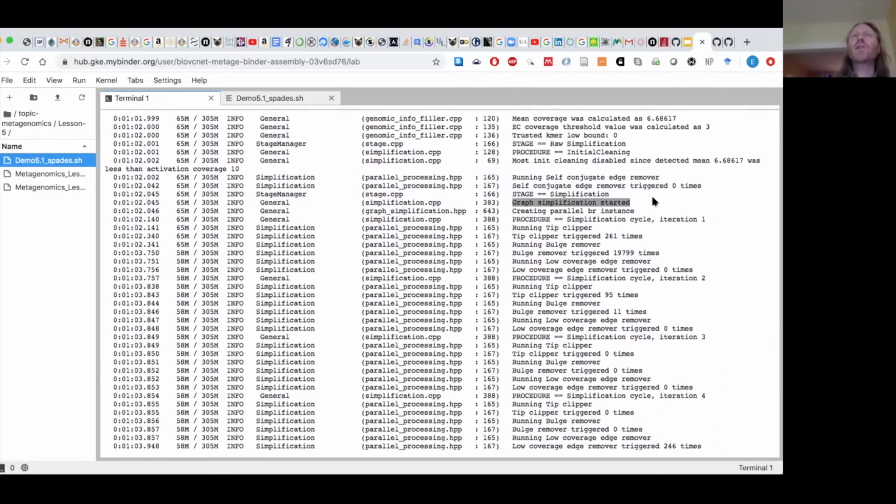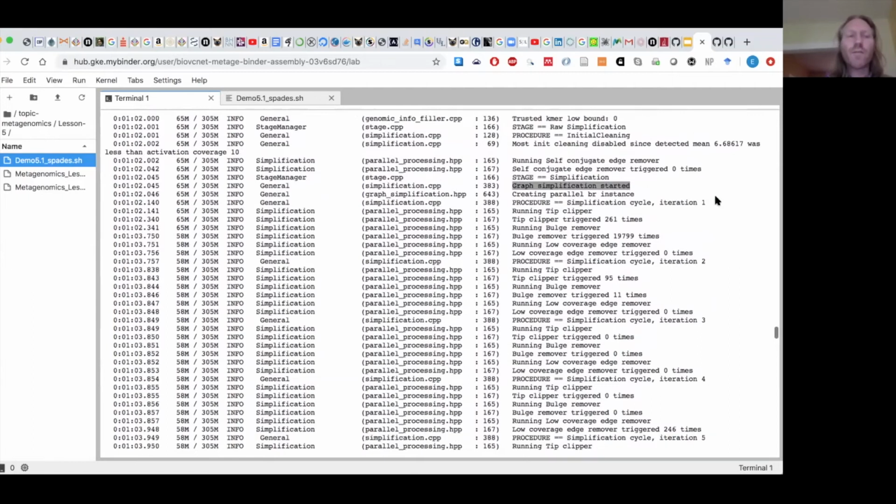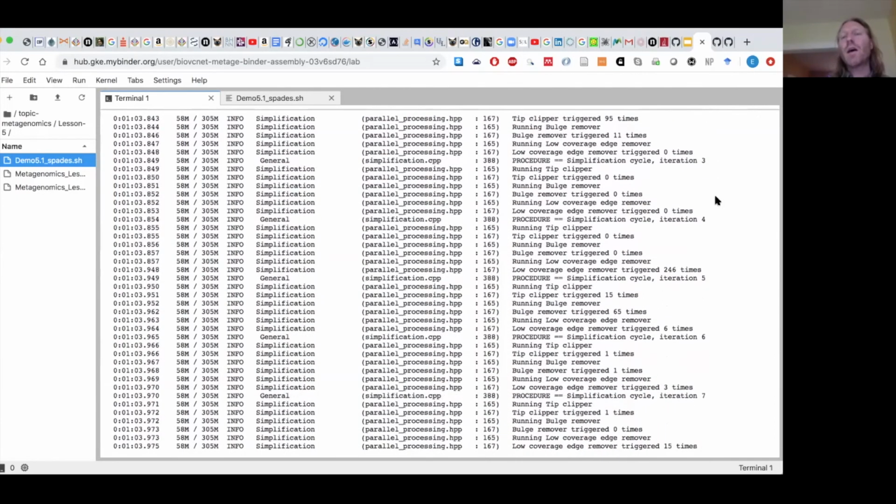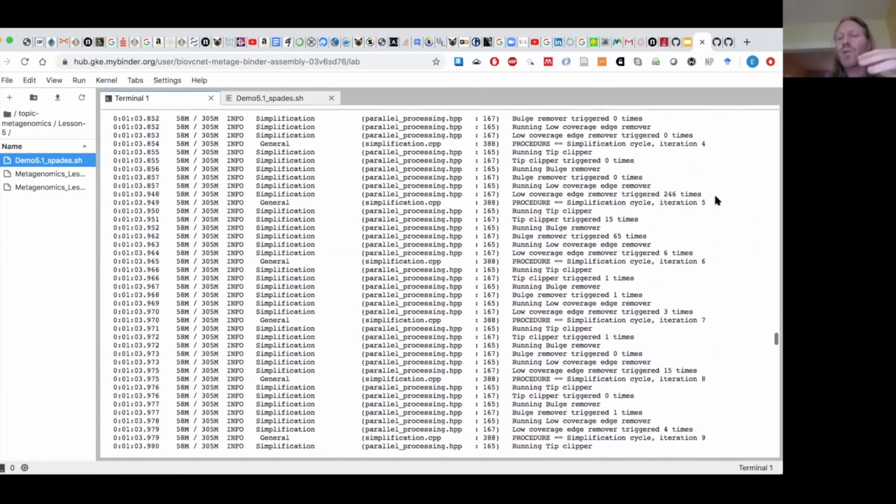So you can imagine, even in that small example we used with 10 reads, there were a lot of nodes and a lot of edges. And you can imagine that those assembly graphs get very complicated very quickly in the intermediate steps. And so a lot of the process of any assembly pipeline is not just producing that graph. None of the software just spits that raw graph out at you. There's always heuristics in there to try and simplify the graph and get closer to the truth.